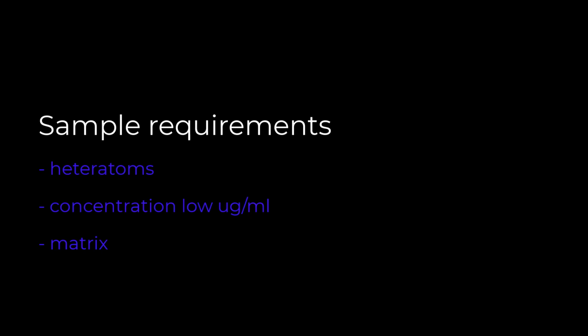Samples should be dissolved in some combination of water, acetonitrile, and methanol, preferably the latter two. Solvents such as THF, DMSO, and nonpolar solvents should not be used. Samples should not contain significant concentrations of buffers, salts, polymers, and inorganic acids and bases.